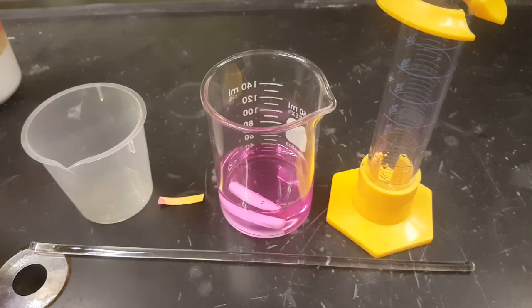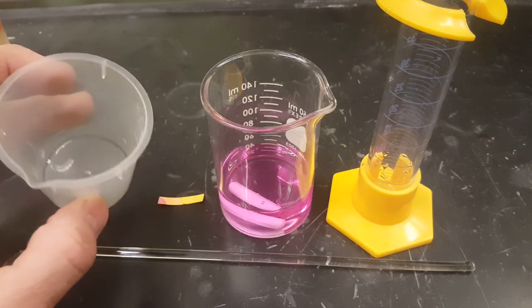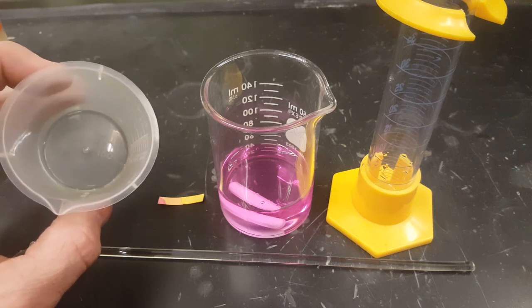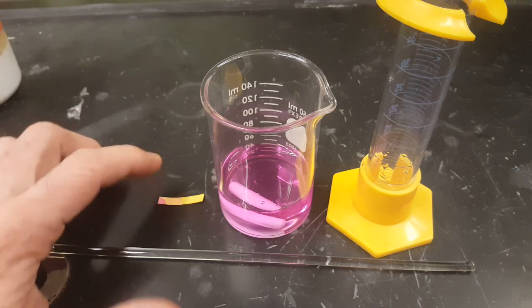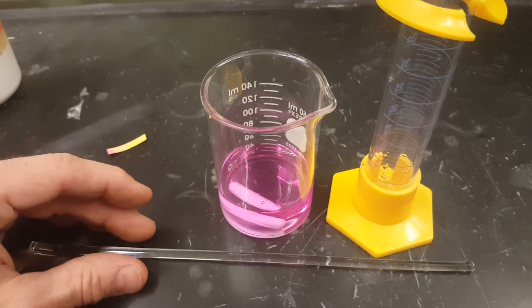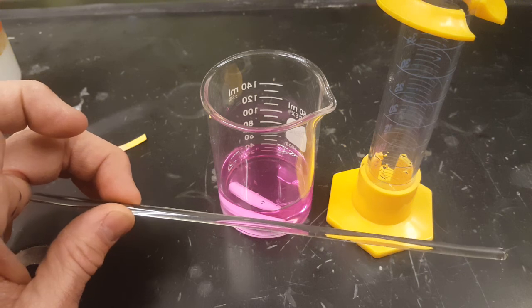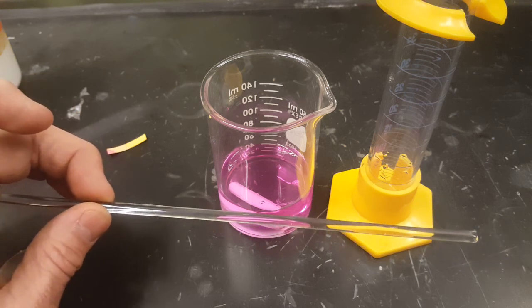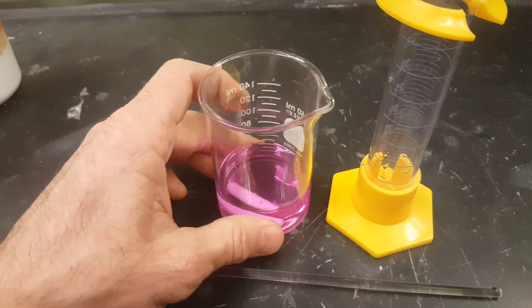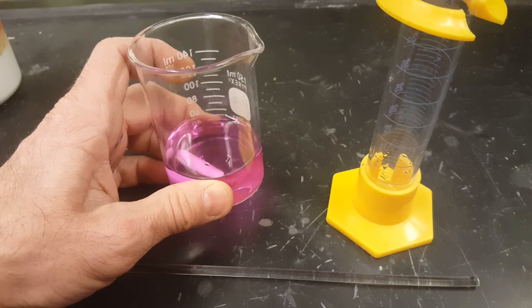When you're all done doing your titration, make sure your urinalysis cup has been sprayed with vinegar and washed and dried. The pH paper can go in the garbage. The stirring rod needs to be rinsed and just put back at your desk. If you dried it, that would be nice too. Just rinse that in your sink. All this is salt and water. And so we're going to pour it down the drain.